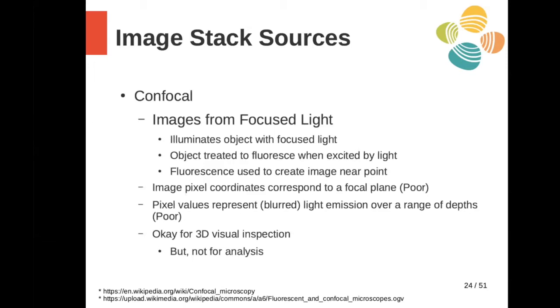This means you don't really have one good one-to-one mapping between the object and the image space. You get bleed through from nearby in the sample. These images tend to correspond poorly with the object space. They tend to be blurred as well. It ends up being a resolution issue.